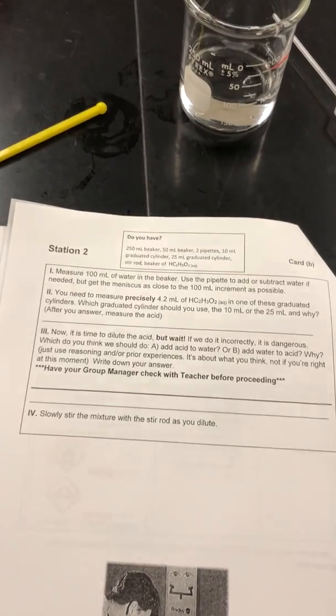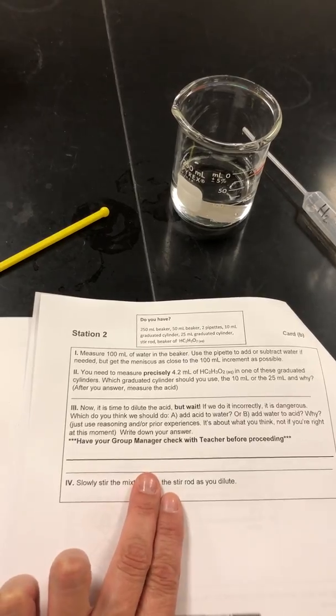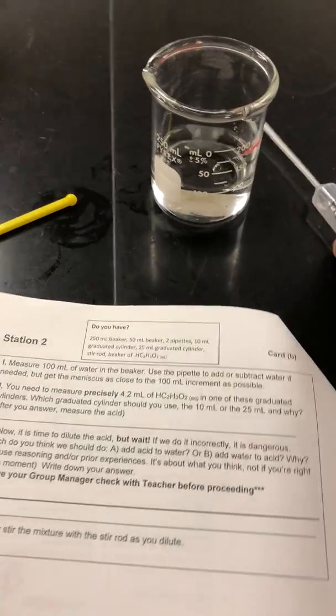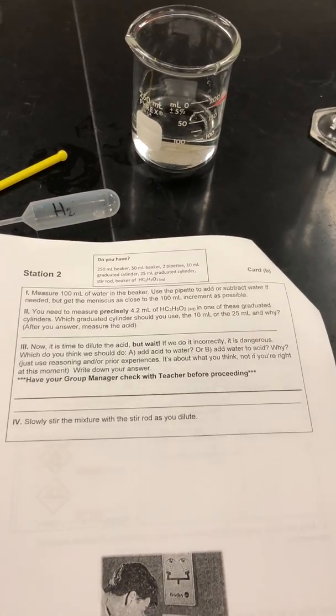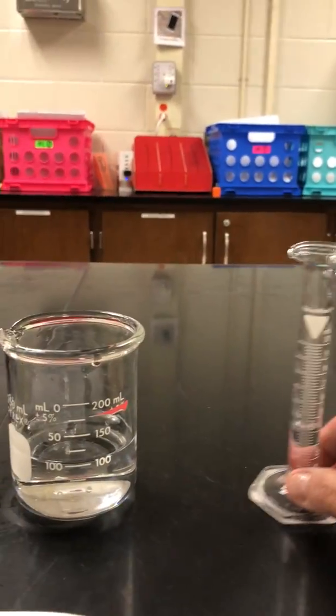Okay, and you are going to write down what you think here. Now, since you're not able to do the lab, you don't really need to check with the teacher, but I don't want to tell you what the answer is, okay? So I want you to write down what you think and then see what your teacher says. But I'm going to help you think about this. Look at the equipment.